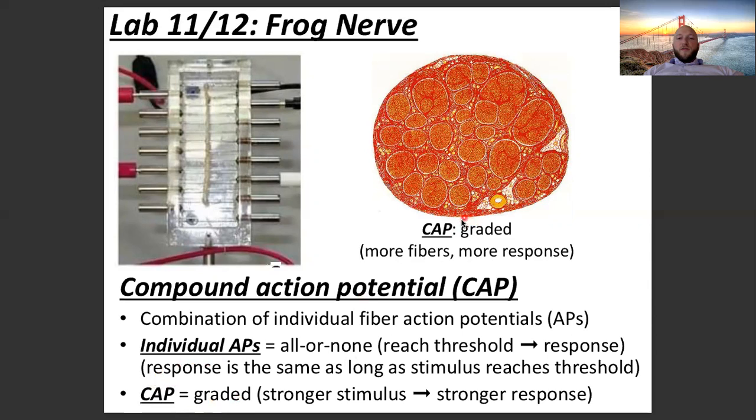So what we're going to do in this lab is imagine this is our sciatic nerve right here. It's going to be resting on an electrode right below it.